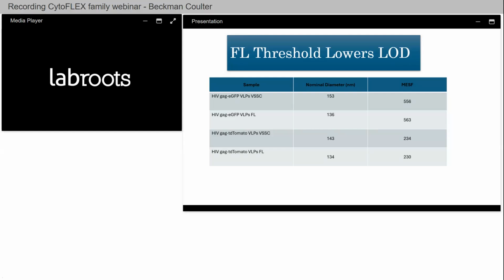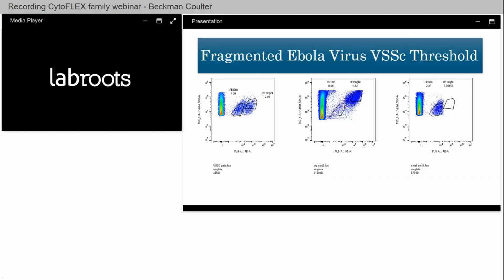And we said it doesn't change, though, what your intensity is. It only changes in how the threshold is accepted and how the limit of detection is affected on the instrument. So it has its benefits. So we went a little bit further because we said, okay, we can't just accept that. We have to keep going, and we want even more.